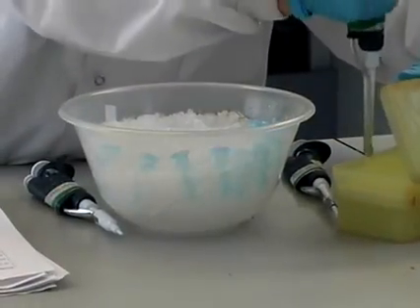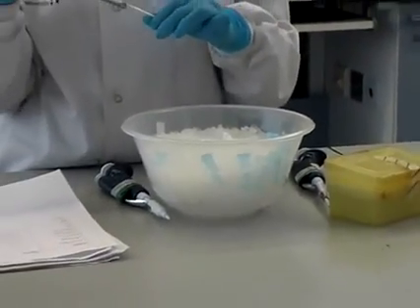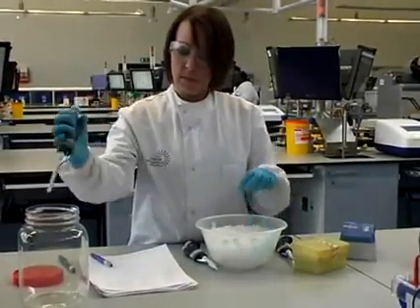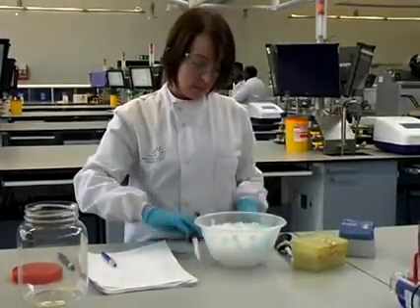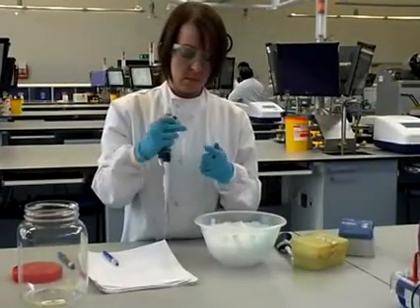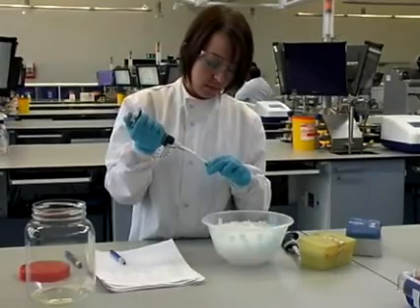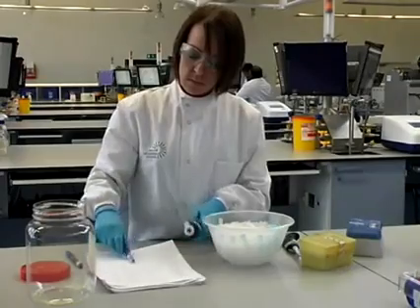After the deoxynucleotide triphosphates have been added, a volume of distilled water is added to the master mix. The final reagent to be added is the Taq polymerase — Taq meaning Thermus aquaticus, which is the bacterium from where the enzyme has been obtained. That is added to the master mix, which is now ready to be added to the sample.